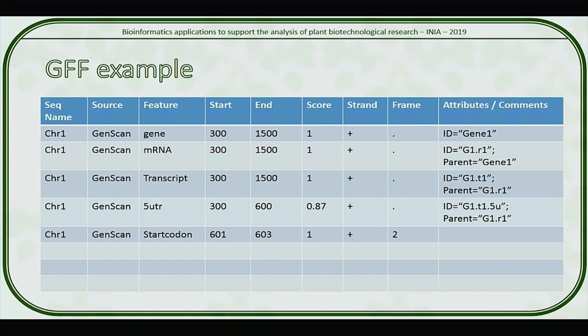And when you do that, if you have a lot of evidence showing, hey, yes, this looks like an exon, because it has alignments to proteins in the database, it also has a start codon, it also has an uninterrupted reading frame, it has RNA-seq aligning to it, it has ESTs that support it, you have all kinds of evidence to say, yeah, I'm 90% sure it is okay. So we can call it an exon.